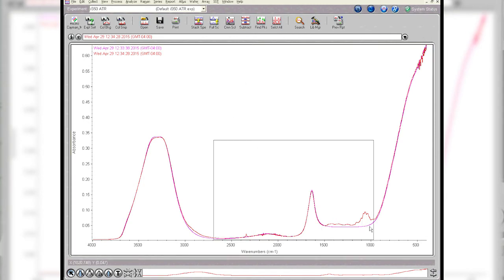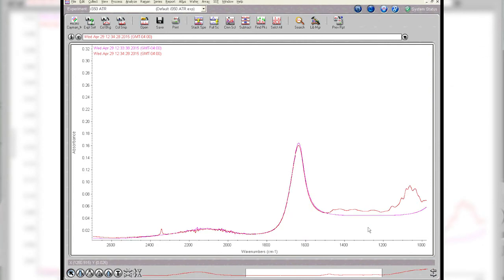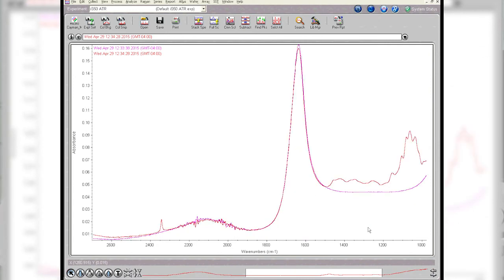So there are the two spectra overlaid right on each other in common scale. Let's zoom just on that part, which is where the interest is, and again, common scale. When you do that, or we can offset them just a little bit. It'd be easier to see if we offset them just a little bit. You can see here, this peak is repeated in both. Well, that's the water, and the majority of the soda is water. But you also see all of these peaks and a sharp little peak right here.